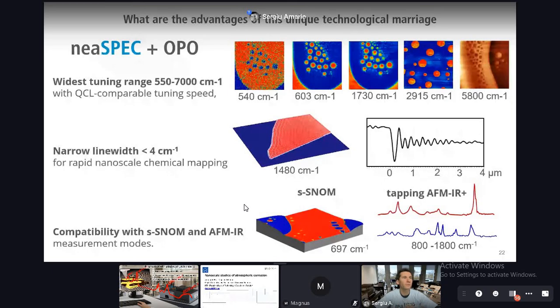That was also presented in one of our past ASNOM webinars, how this automatic relation between the modulation of the mirror and the frequency occurs. So I don't know if you have a microscope which has that software, but if not, then let's get in contact and go together to see what solution is best for you.